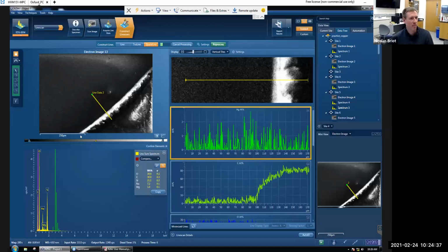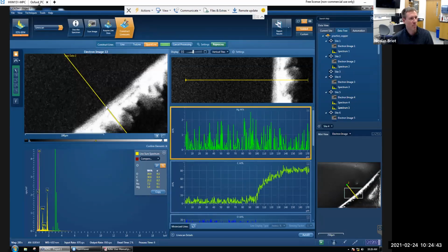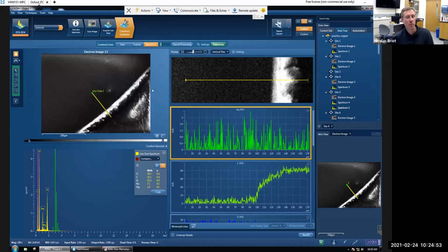Whereas right now, if I share again the screen, you can see that the scale bar is 250 microns, right? So if you have silver just in the first micron or so, it's going to be completely lost here. And you could be in that noise here, right? But that's part of it, right? We just don't know when we start. So that's why we have both types of samples. We have the cross section and we have the surface. So this should be the same sample. This is the 5% silver and potassium. Interesting.